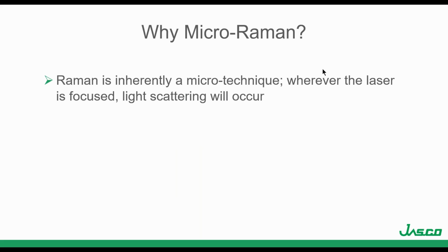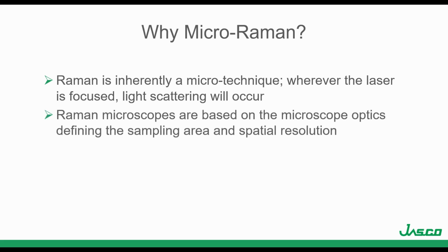So why micro-Raman? Why would somebody like to look at micro-Raman? Well, Raman is a micro technique. So this means that actually where the laser is focused, in that same spot, the light is going to be scattered, and that is what we want to actually measure.